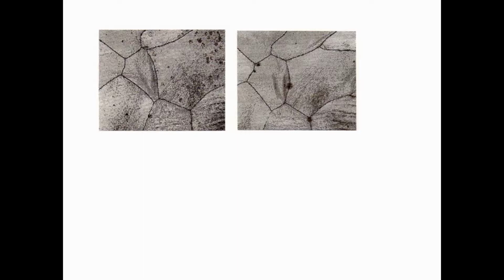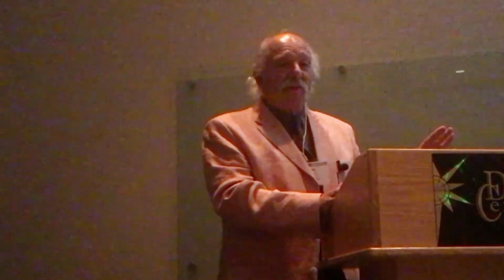And you look at these features here, a few microns down, you see this grain is now larger, and we're looking at these features which are very clearly, we can see their sub-boundaries, their dislocation clusters showing mechanical damage in the material. And the image quality map is used all the time now to give an idea of the state of the residual damage and or structural strain in the sample, but it's qualitative, purely qualitative.